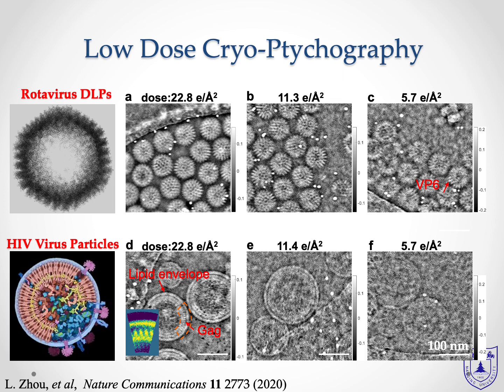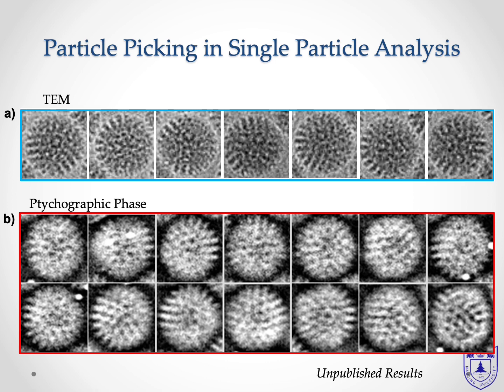Therefore, the ptychographic reconstruction is very low dose efficient, and can be applied to biological molecular imaging in the cryo state at very low dose.